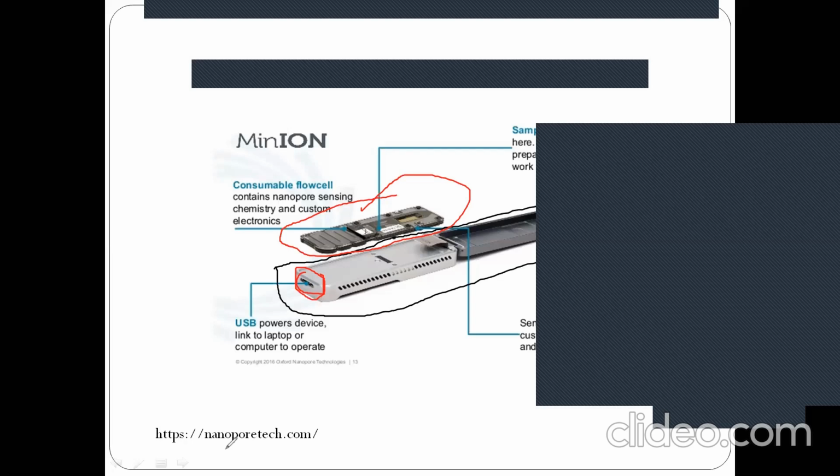And if you are really doing something in the mood of whole genome sequencing and de novo sequencing, then I think you must stick to your PacBio platform, because PacBio has at least over 99% accuracy. And if it is not 99%, then at least over 95% accuracy.